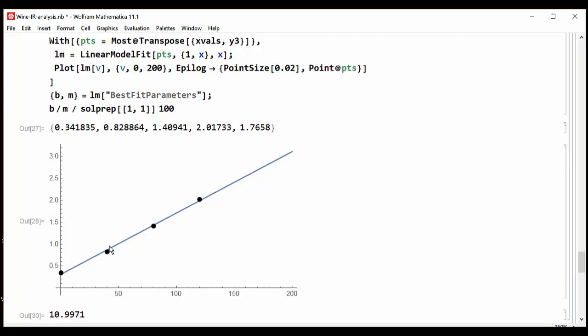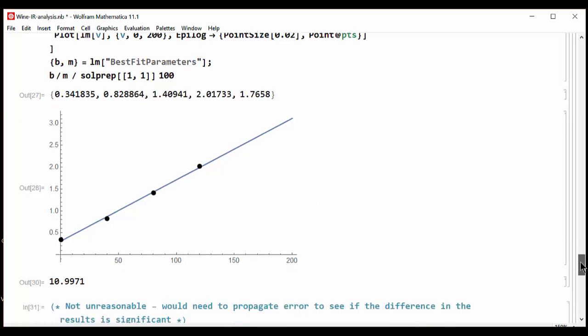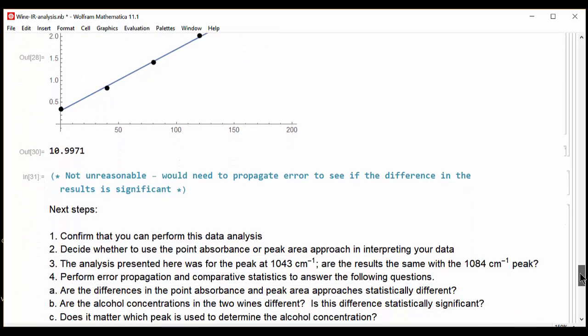Reasonable linearity, and we get around 11% for the concentration of the alcohol. It is possible that the errors that we see here, the slight deviations, make this number and the previous one similar from a statistical standpoint. But a propagation of error needs to be performed in order to do that.